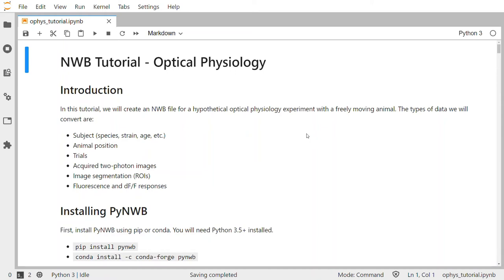This is the Python tutorial for how to read and write optical physiology data using the NeuroData Without Borders, or NWB, neurophysiology data standard. In this tutorial we will create an NWB file for a hypothetical experiment recording optical imaging data from a freely moving animal.